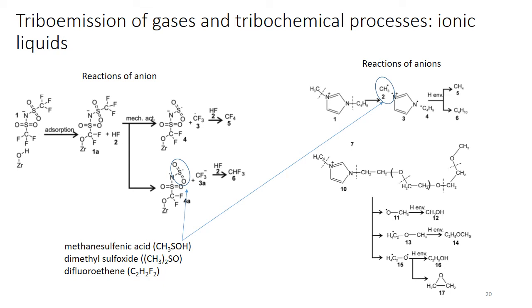We do not know exactly which compound it is, but the mass spectrum of these three compounds has some components which cannot be explained by the others.